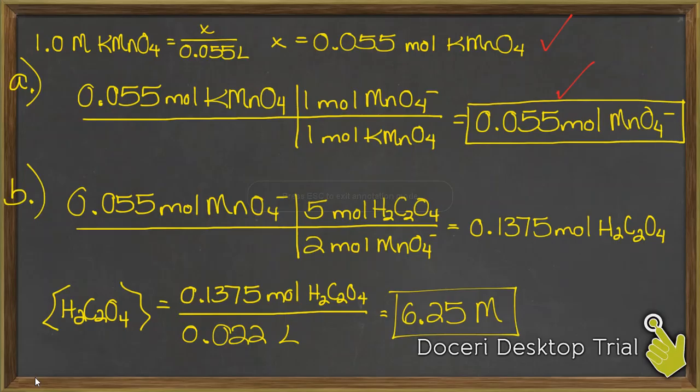Then we were to use that information to eventually find the molarity of that oxalic acid.